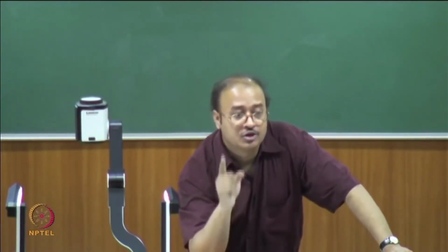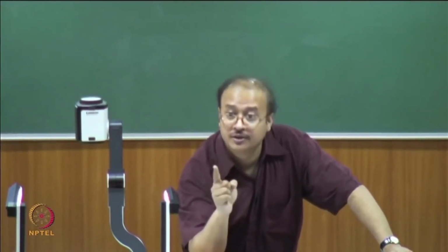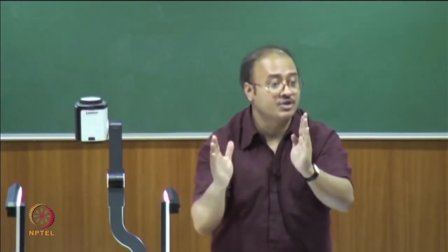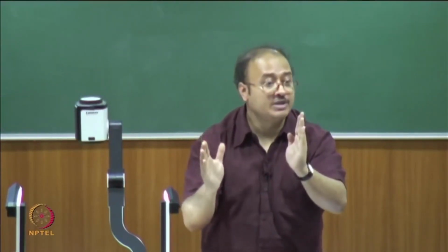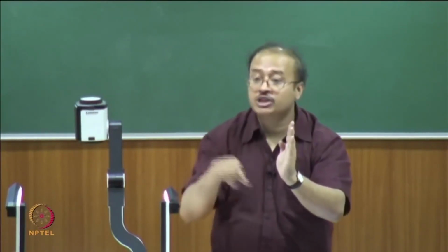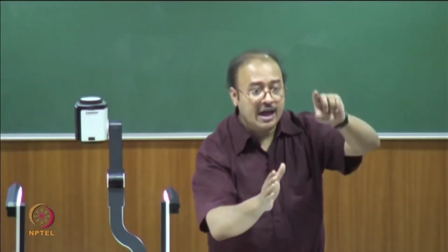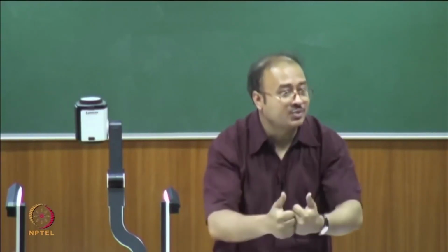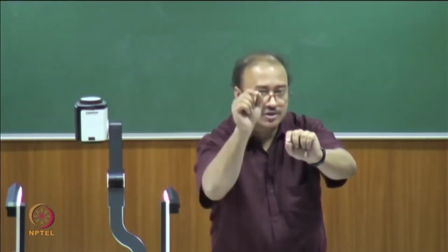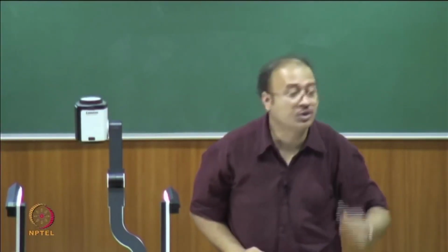Did you get my point? So, the probe laser has a fixed lasing frequency at what? 1630 centimeter inverse, just one. So, if the probe laser is fixed at 1630 and you are doing a temperature jump, because the protein is unfolding, the intensity which was there at T1 at 1630 would decrease when you go to T2. Because it decreases, the probe would pick it up, because it is always fixed at 1630. So, as you have increased the temperature and the protein is responding, at every time point the probe slowly sees that the intensity at 1630 is decreasing as a function of time, and then you pick the kinetics up with the detector. That is what your probe laser is doing.